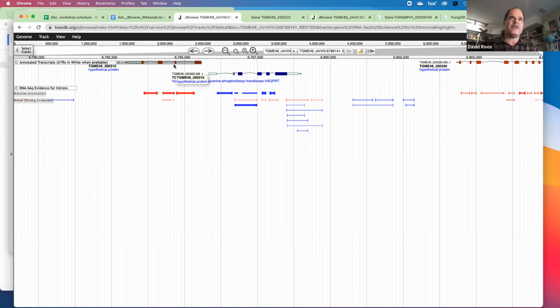In this upstream gene here, we see weak evidence for hundreds of introns that suggest there may be an exon skip polymorphism in this gene as well, but at a frequency that's about 2% of the most abundant intron. So this immediately highlights the importance of being able to read RNA-seq data.